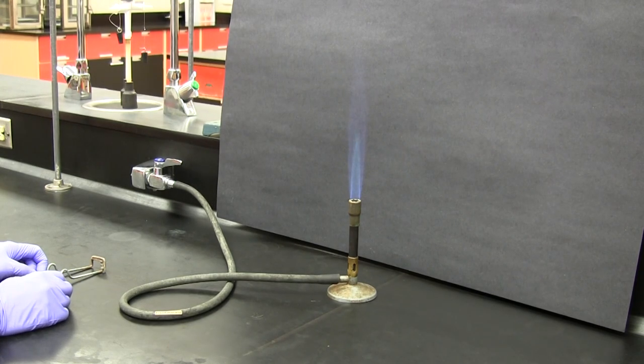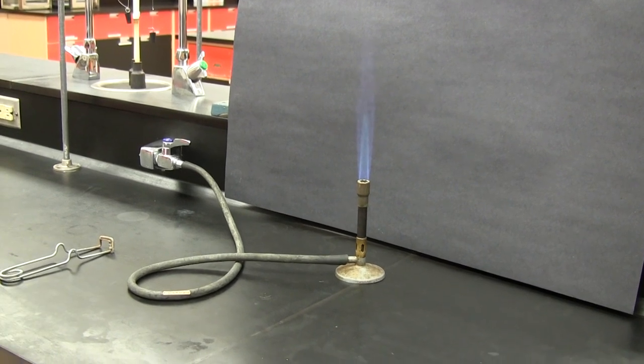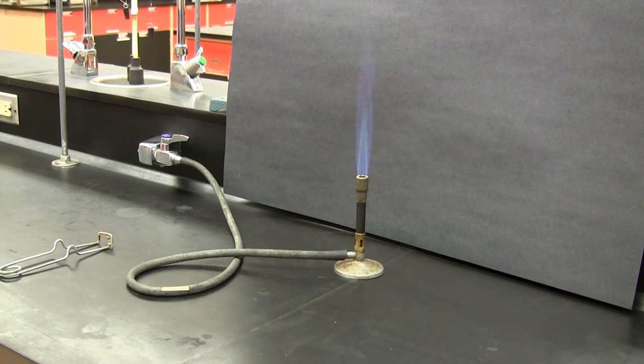Never use a yellow flame for heating purposes in the lab because it will produce a lot of carbon or soot on the surface of whatever it is you're heating.